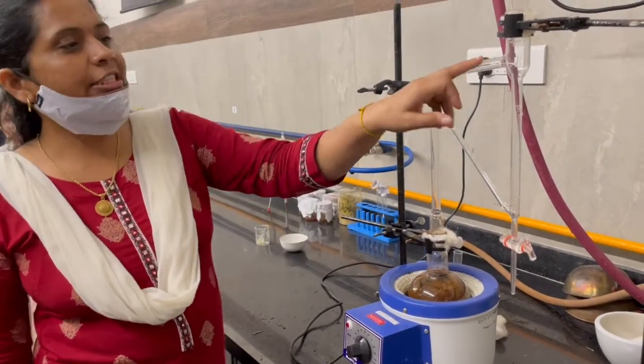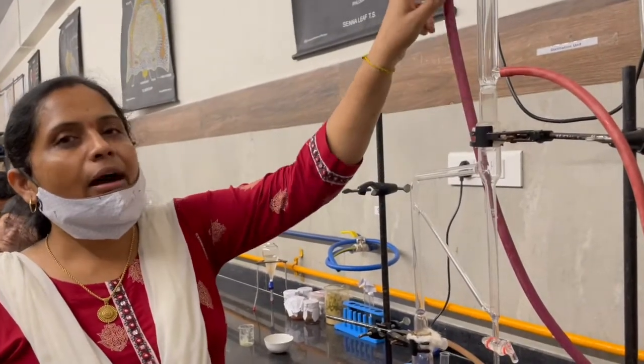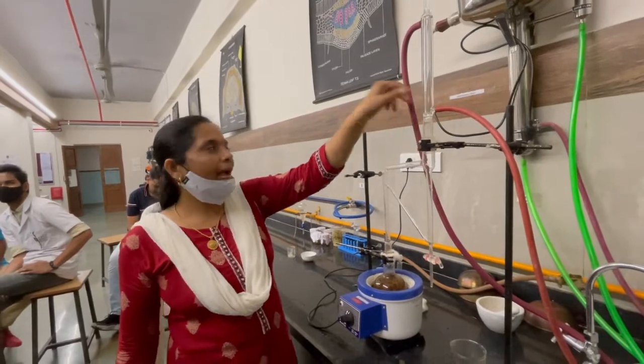This is a Clevenger assembly. Here is a condenser which has an inlet and outlet. Proper water supply and electricity supply is needed for our whole practical.